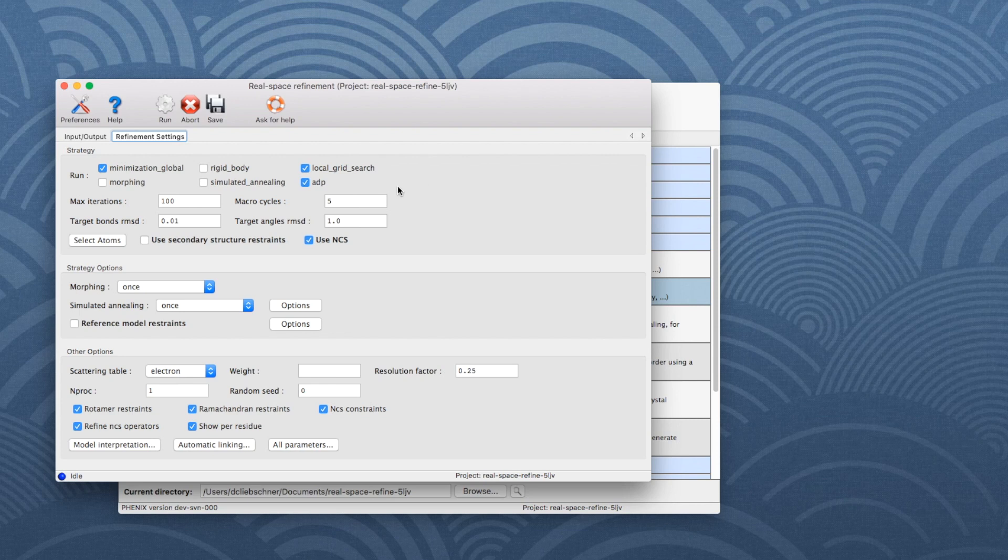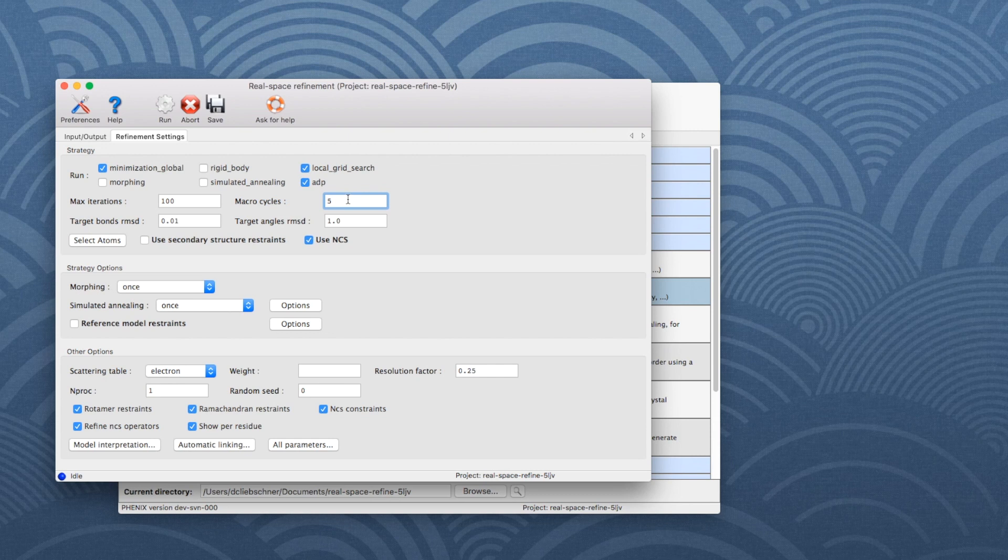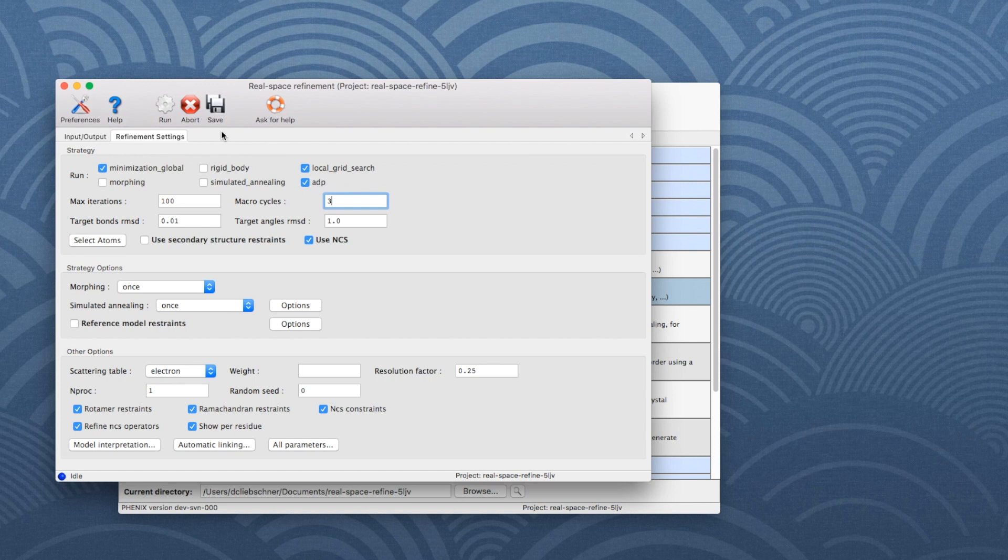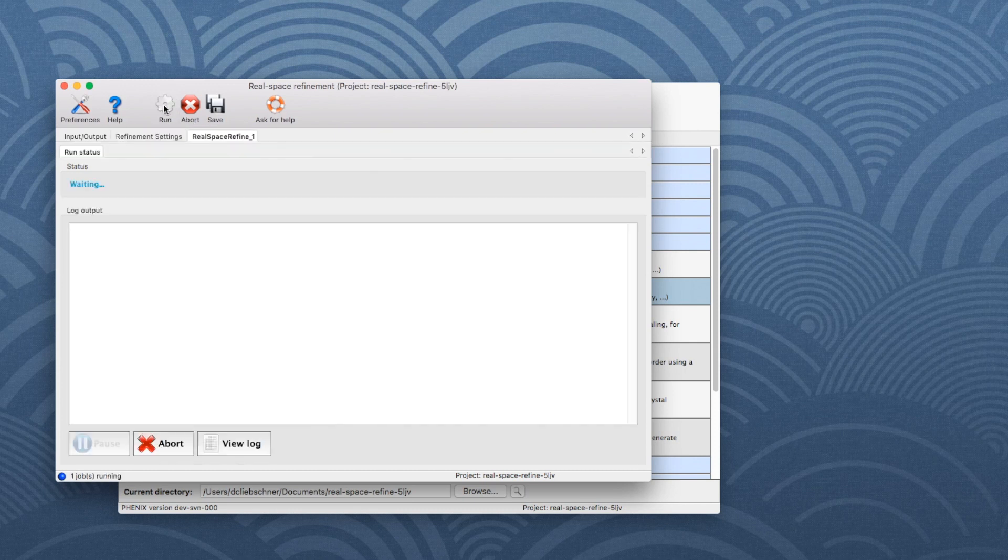The default number of refinement cycles is set to 5, but it can be changed. Set it to 3 for this tutorial to speed up the runtime. Click the Run button on the toolbar to start the refinement.